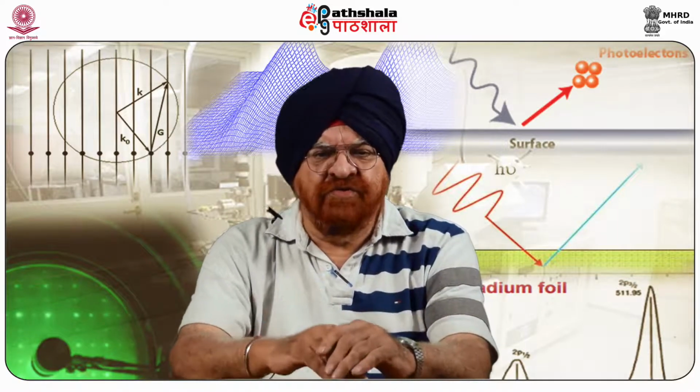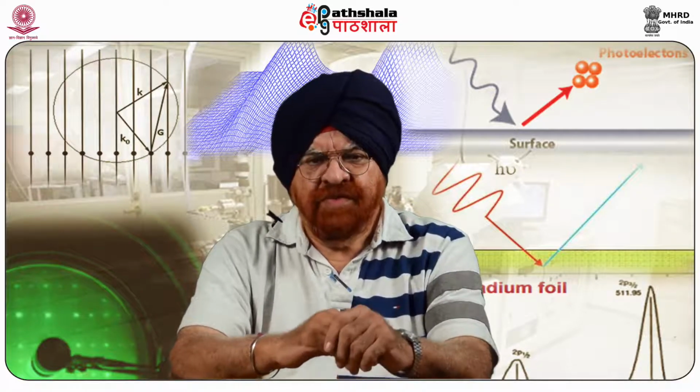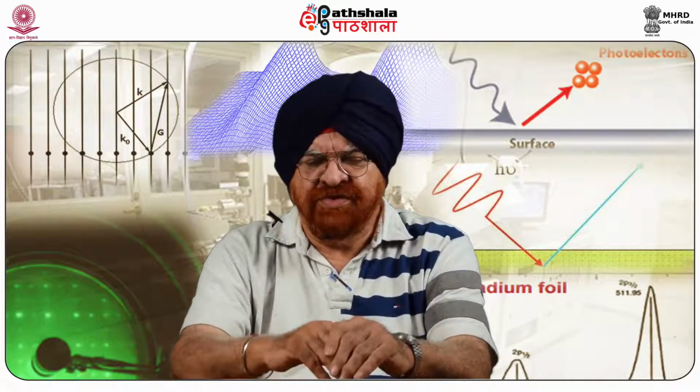This has been a very important discovery by Sir William Thomson. Now, this discovery can be explained in terms of work function differences.